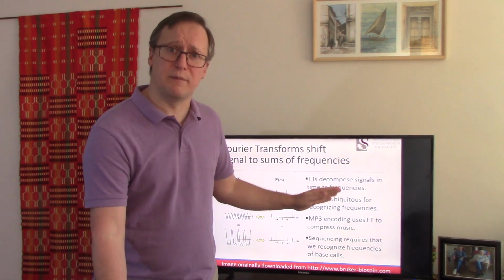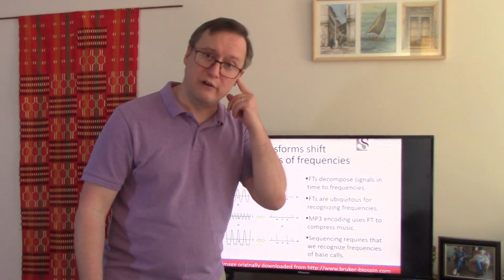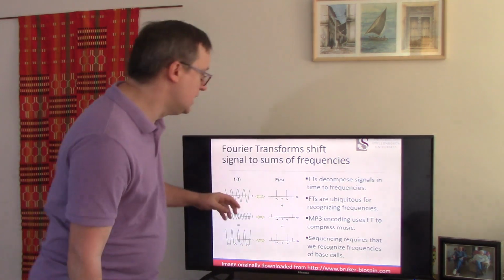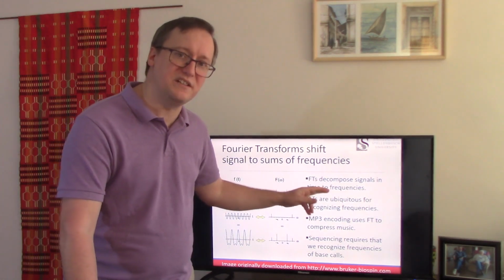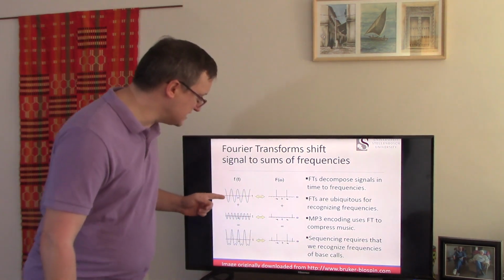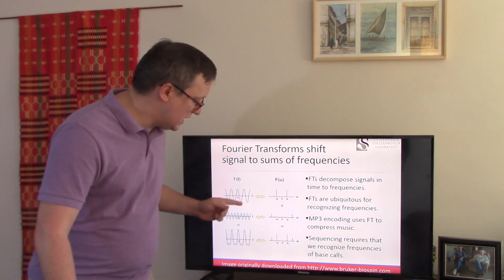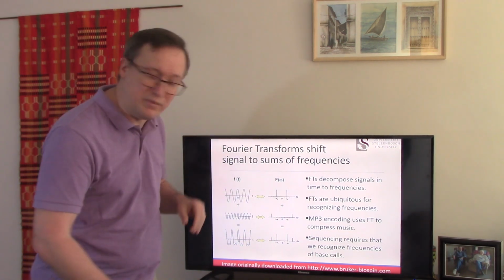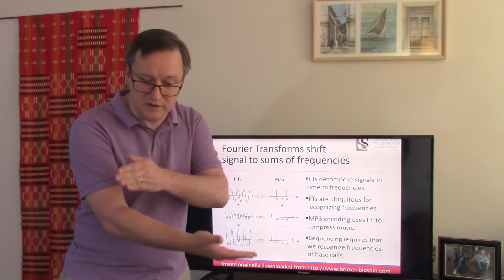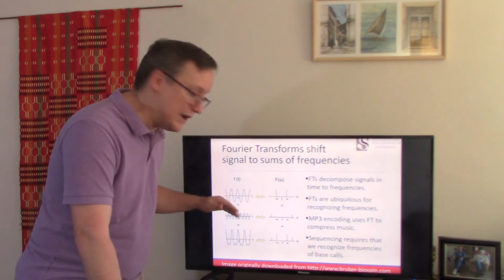Fourier transform represents our way of revisualizing a time-dependent signal, whether that's what you're hearing at a party or what the electropherogram is measuring as intensities for these traces. It's decomposing this time-dependent intensity signal into characteristic frequencies. Let's imagine this first wave that we see. We see that it's got a pretty good amplitude, meaning it's very high and very low above zero, and it's got a nice steady characteristic frequency, the bandwidth is exactly the same throughout the course of this.